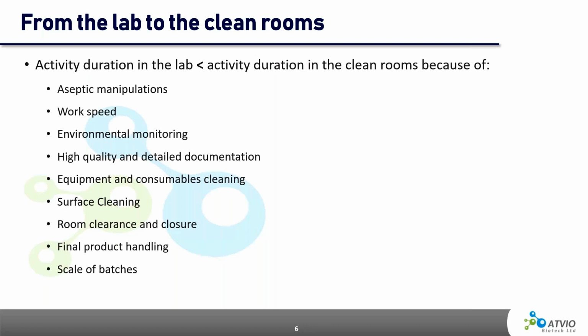Another example is in an R&D setting. When the operator needs to enter something into the hood, he takes his hands out, brings the missing item, sprays the item and his hands with ethanol, and goes back to the hood.